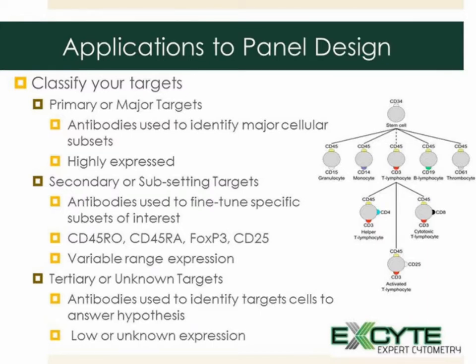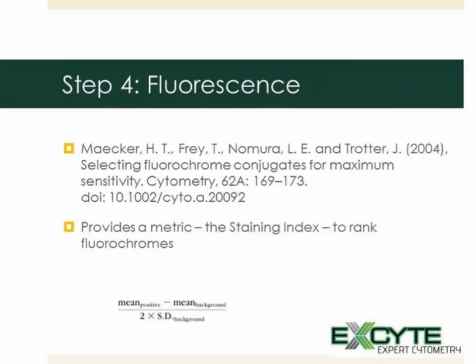The third classification are my tertiary or my unknown targets. These either I have no idea what their expression is, or these are the targets that I'm actually questioning and interested in. So these are the ones that are going to be used to answer my biological questions. Now we're going to put this aside for a minute. We're going to talk about fluorescence because we're going to then couple these together.